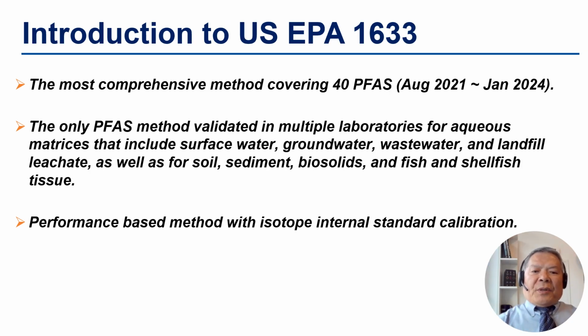So far, this EPA method is the most comprehensive method that covers 40 PFAS. And this is also the only PFAS method that has been extensively validated by different laboratories for non-potable water, such as surface water, wastewater, groundwater, and soil, solid, sediment, biosolid, fish, shellfish tissues.